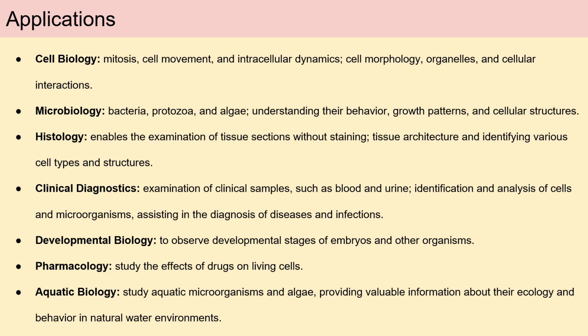In microbiology, phase contrast microscopy allows for the detailed observation of microorganisms like bacteria, protozoa, and algae, providing insights into their behavior, growth patterns, and cellular structures.